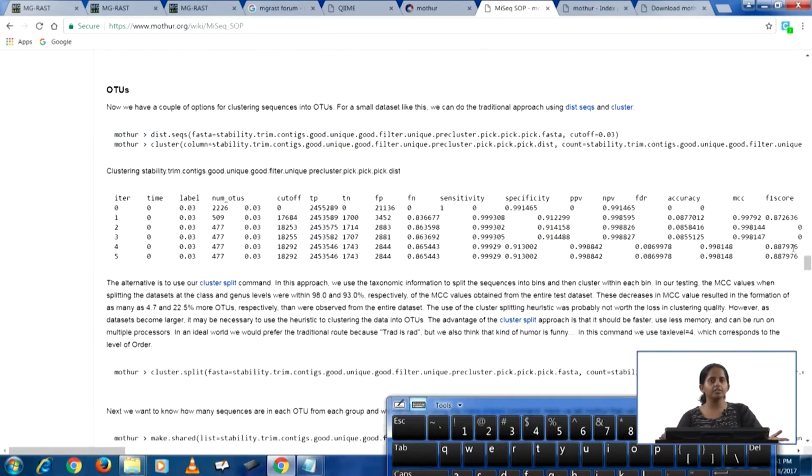Alright, another thing you need to know: Mothur and QIIME don't have a graphical user interface. So you don't click on a window and pick from a drop down list what you want to do, but you'll have to write the commands. Thankfully, both Mothur and QIIME have very good documentation, so you will never be lost. For almost all kinds of data analysis you need to do, they'll inform you.